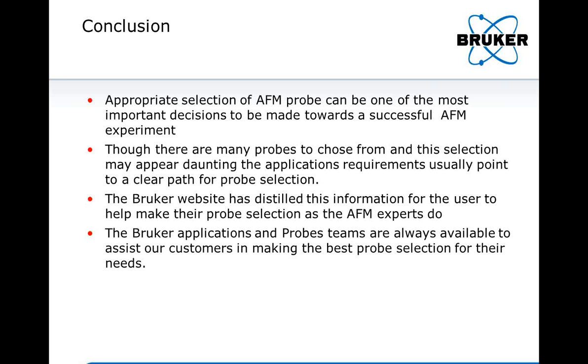What is the recommended probe for QNM of biomaterials with a modulus range of 2 to 5 gigapascals? I guess the question is either air or liquid. This is sort of a follow-on: what's a recommended substrate for mounting? And you need to calibrate the tip radius each time for different samples, even if you're using the same probe type, and if you're using the absolute calibration method.